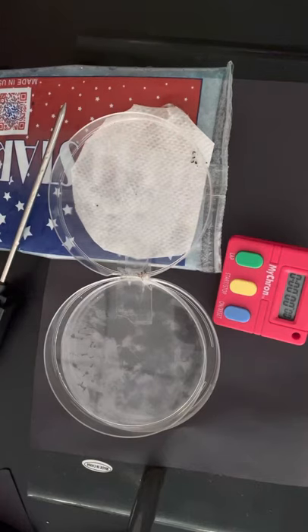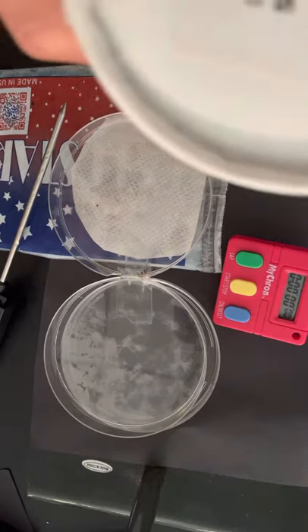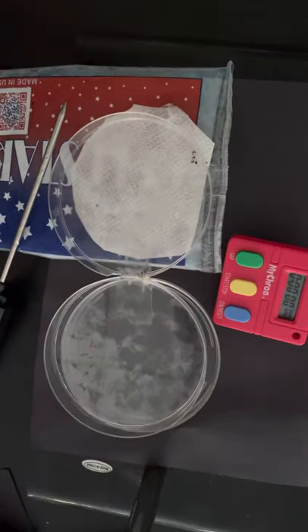We are going to take a look at sow bugs, which are a species of isopod. We have a behavior chamber set up to observe their behavior.